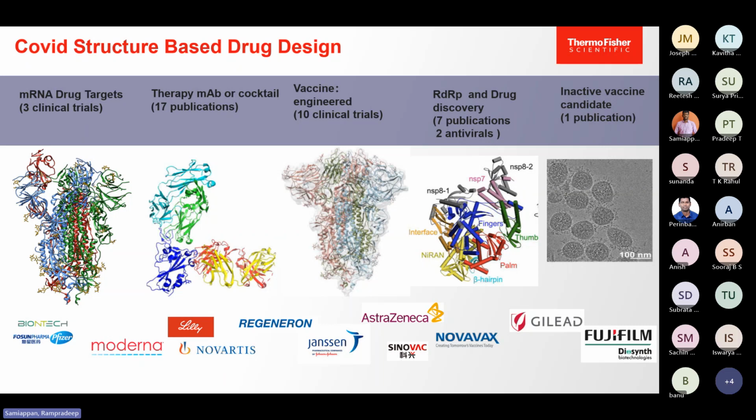They used lipid nanoparticles as an example, and also liposomes, and they worked on different particle types, but ultimately the overall period was very quick. I think it took 18 months for most of the companies to come up with the drugs, and cryo-EM played a very important role over here.